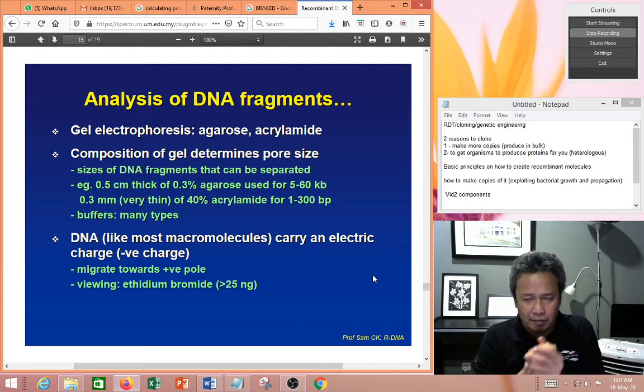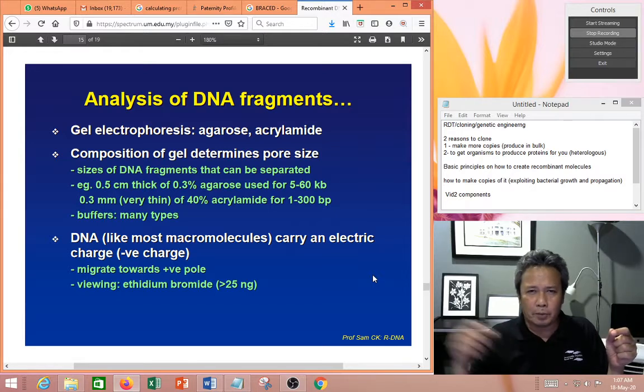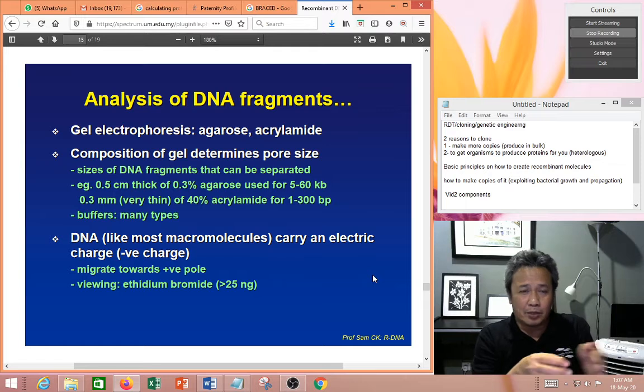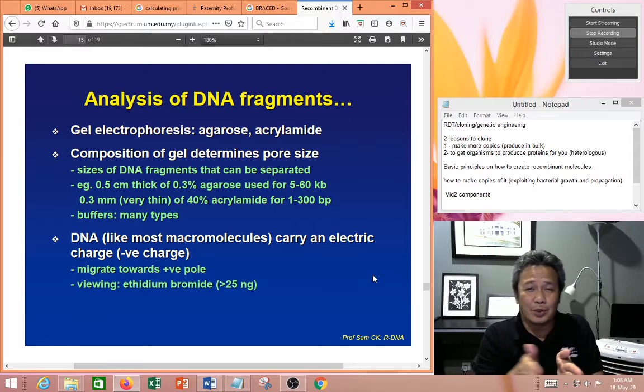So that means if you have a mixture of DNA, right? Let's say you have a long piece of DNA and you want to cut a small piece out. You put in your enzymes, and it will cut that small piece out. Then you take this mixture and you run it on a gel. If you run it long enough, you'll find that the DNA will be separated, because the fragment that you have cut is a small fragment, so it runs quicker. Whatever is left are the long fragments, and they travel much slower. In the end, you get two bands.